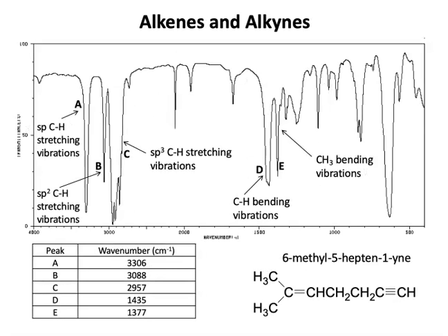There's probably a little too much going on in this slide since it's got both an alkene and an alkyne, but these are different areas that we've learned to concentrate on. First of all, notice that this region from around 2000 has a couple of peaks, but typically there's just one. Let's look at this guy. That's probably due to this CC stretch right there.